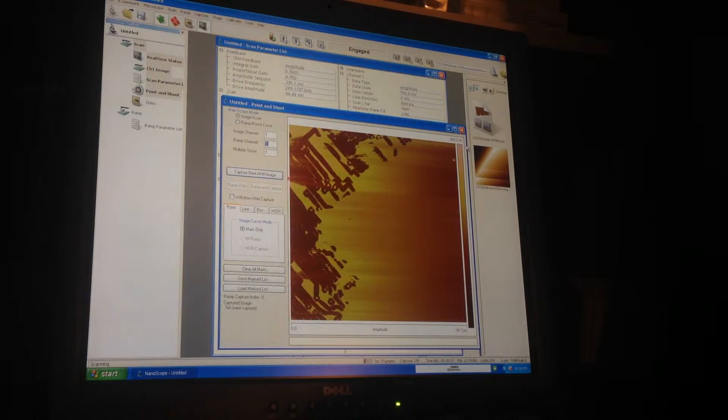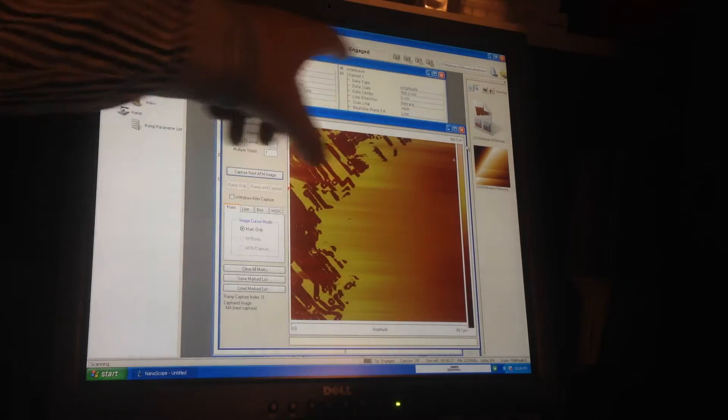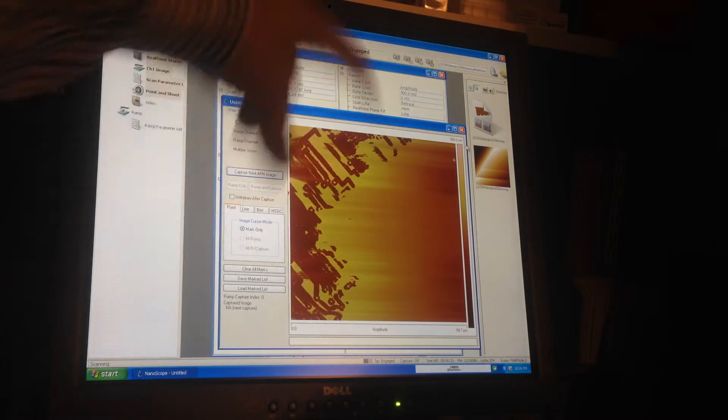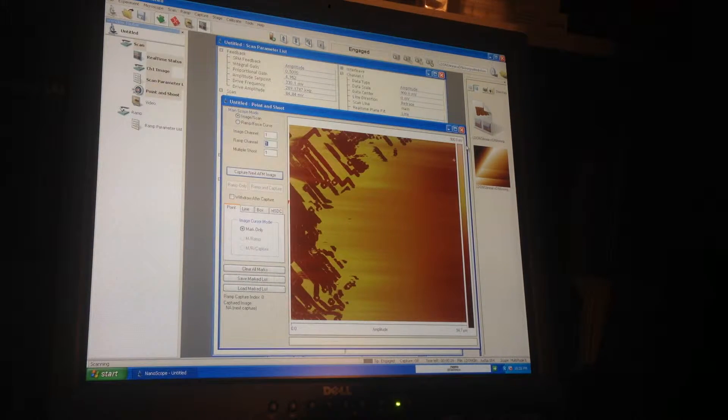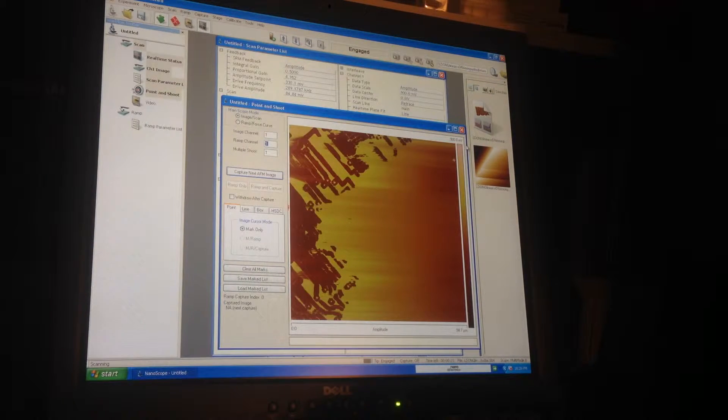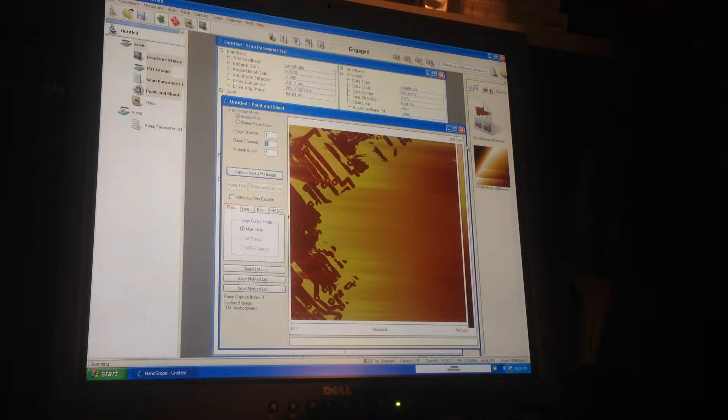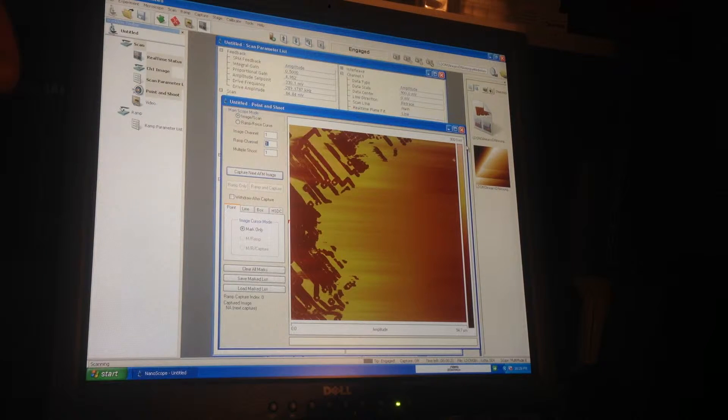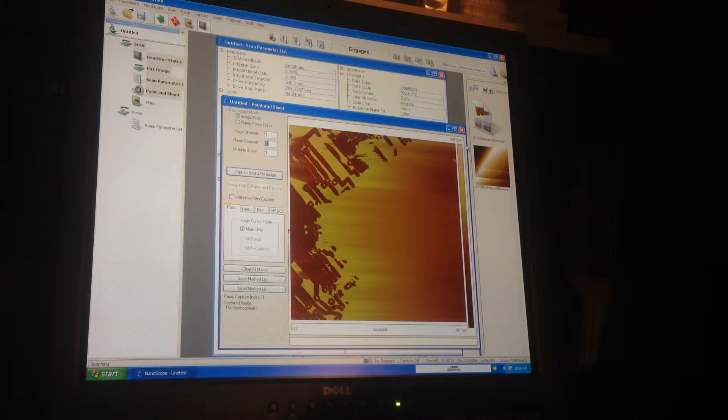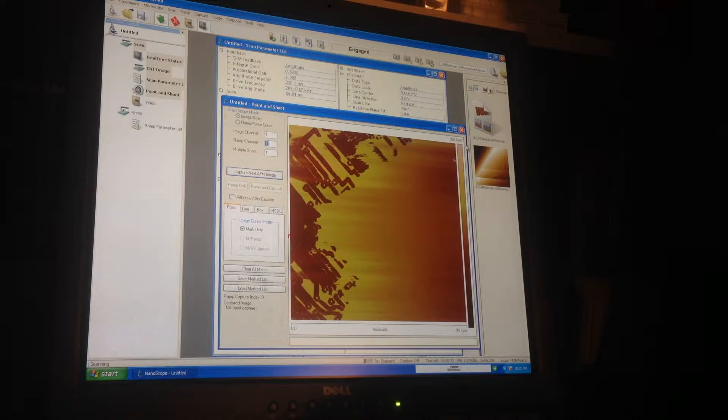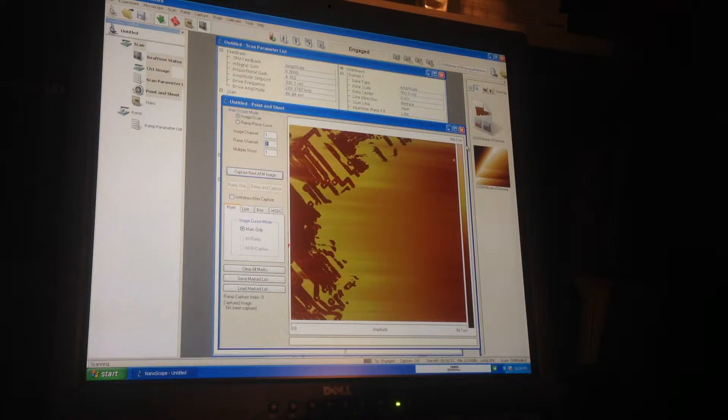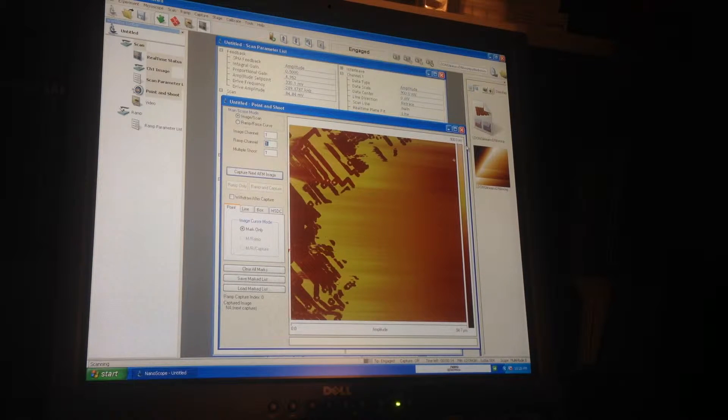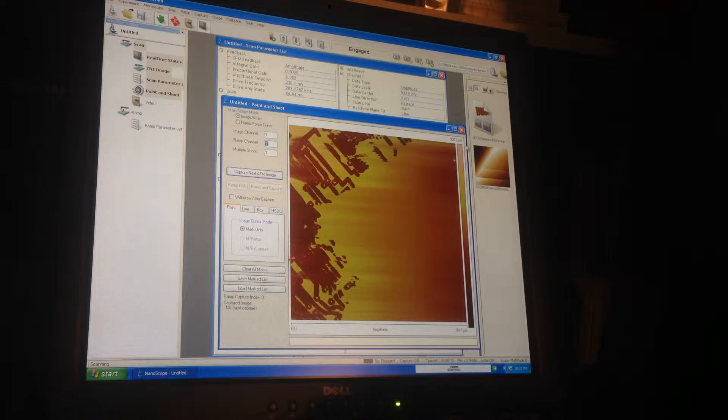This is an FPGA - I can't remember the name of a company but I'll link in the images and the name of the part - but it's like a late 90s FPGA.